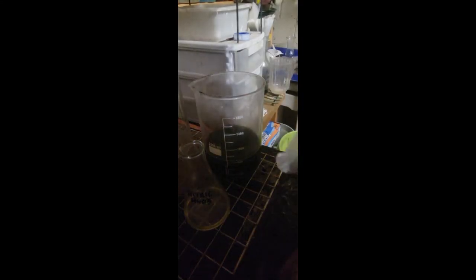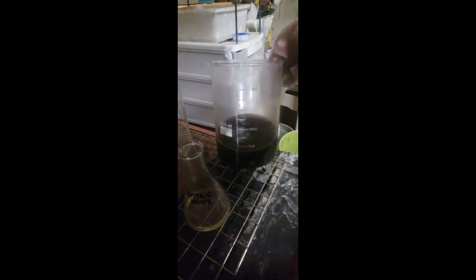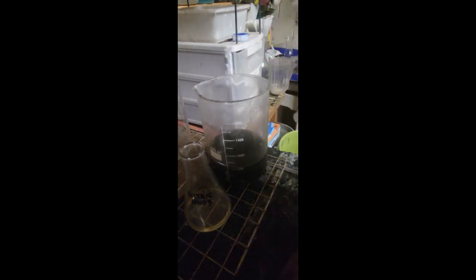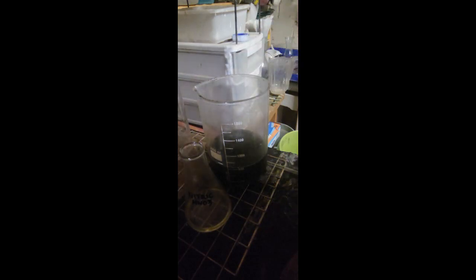All right, everybody, welcome back. I've now created enough of a solution that I'm satisfied. What you're going to do, and what I have done, was basically take my vessels that I've dissolved the silver in, and I just poured everything into one, okay? Including the jar that you use to spray the spoons off of, you dump that into, all right? Like a witch's cauldron, you dump it all in, all into one.